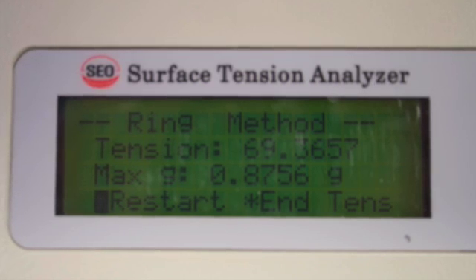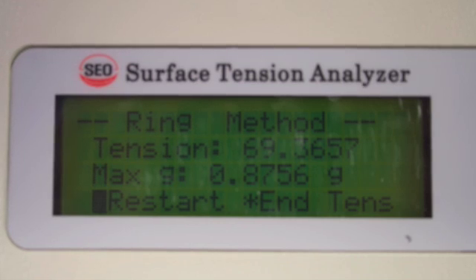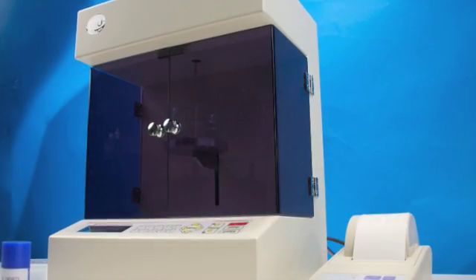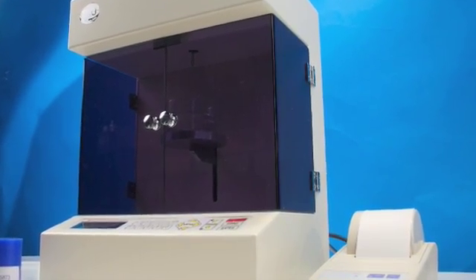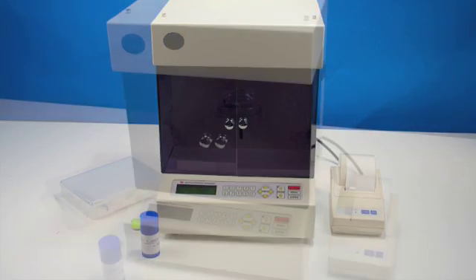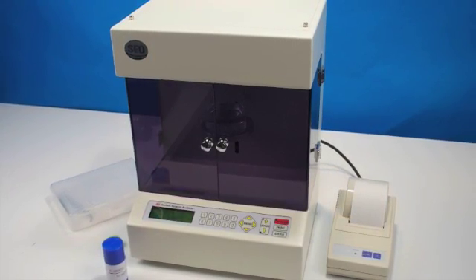To begin another test, the operator simply presses the ENTER key again to restart the process. At just over 17 pounds and a footprint of 12 inches by 9 inches by 15 inches, the DST-60 can fit in almost any environment.